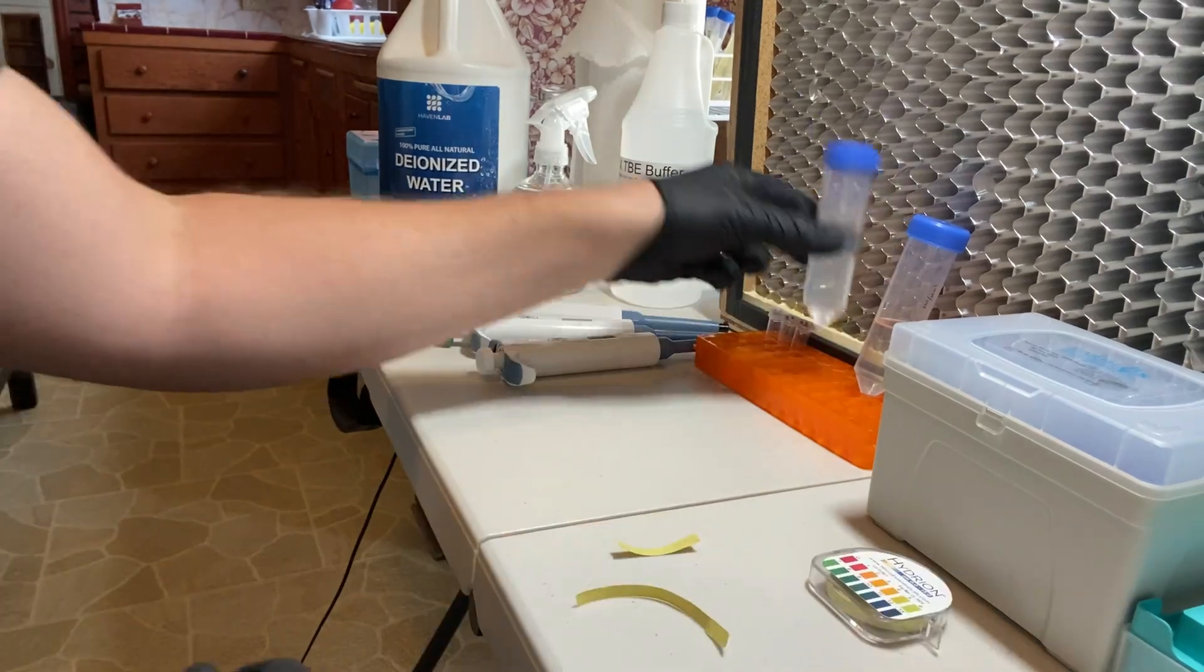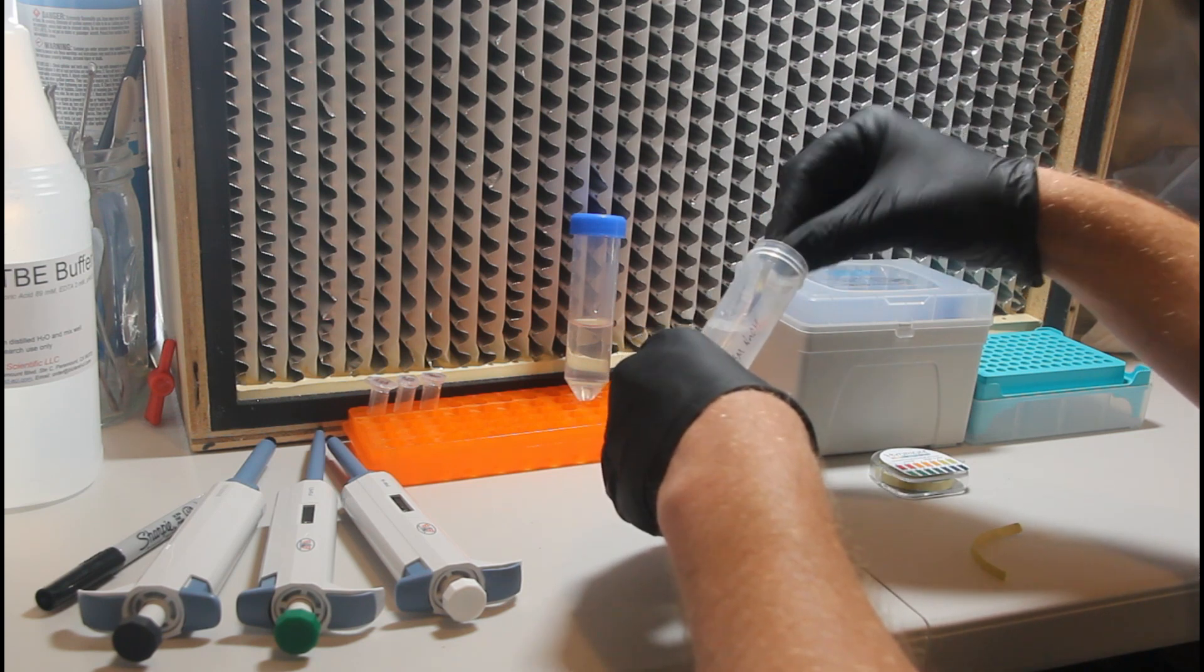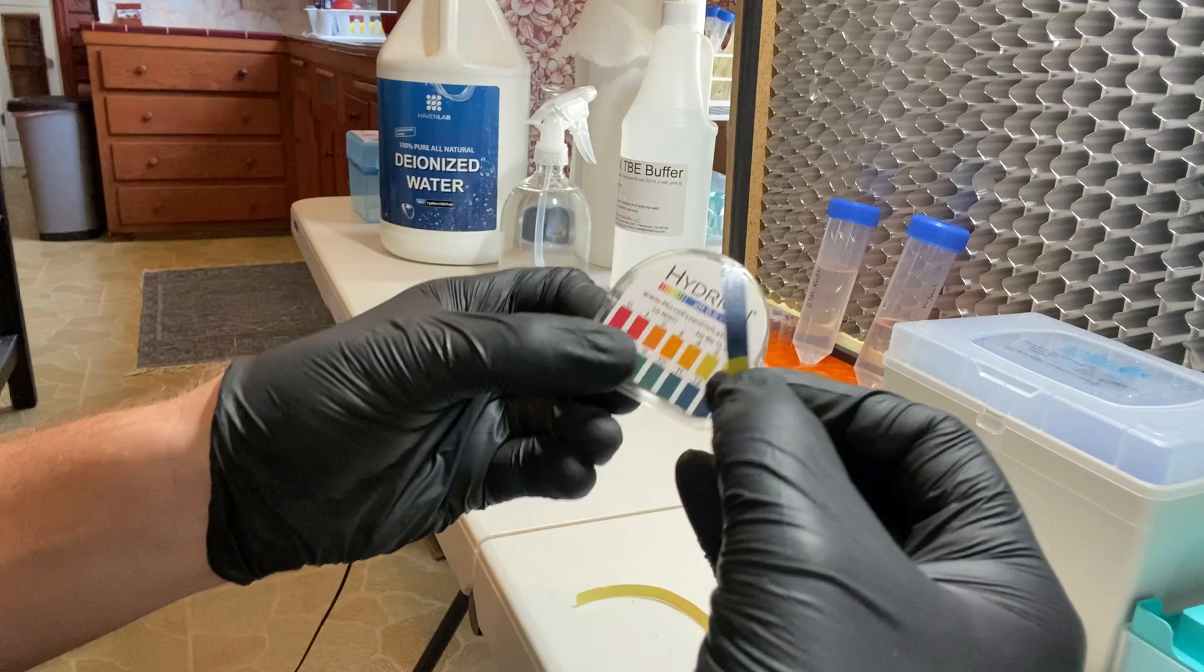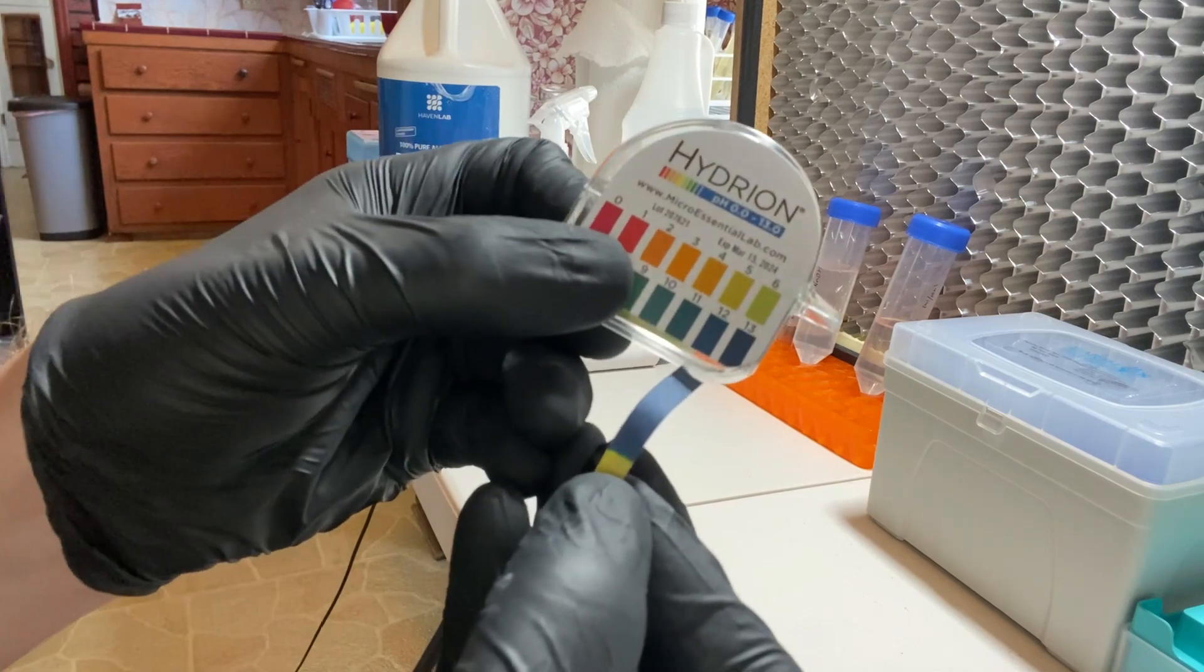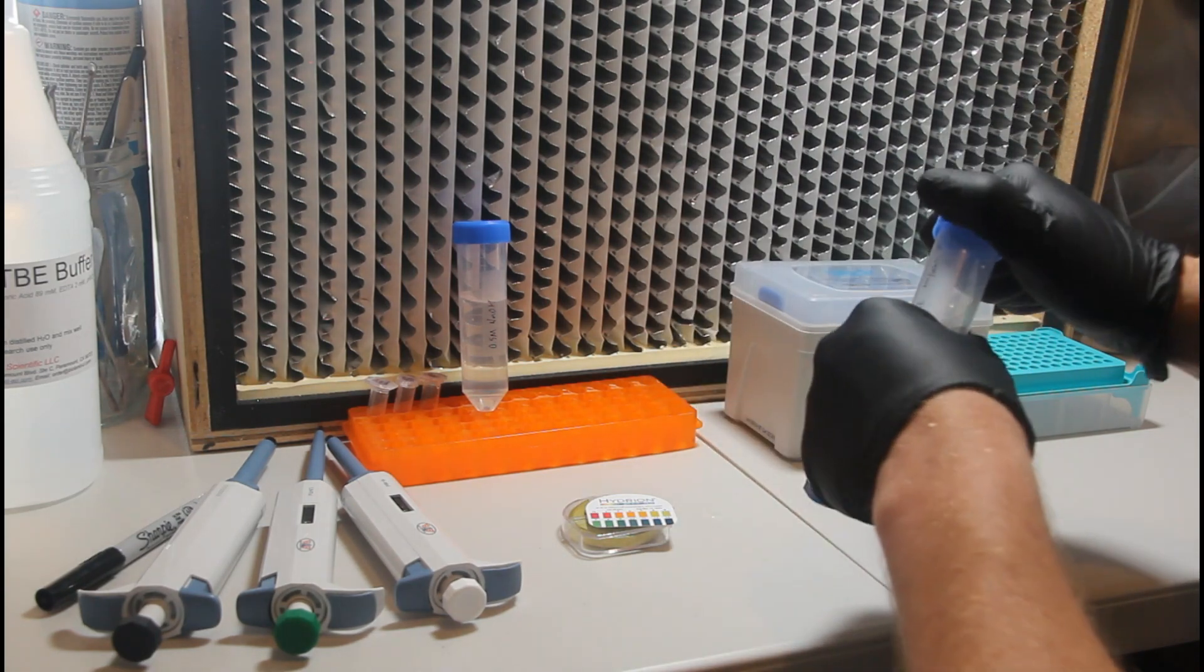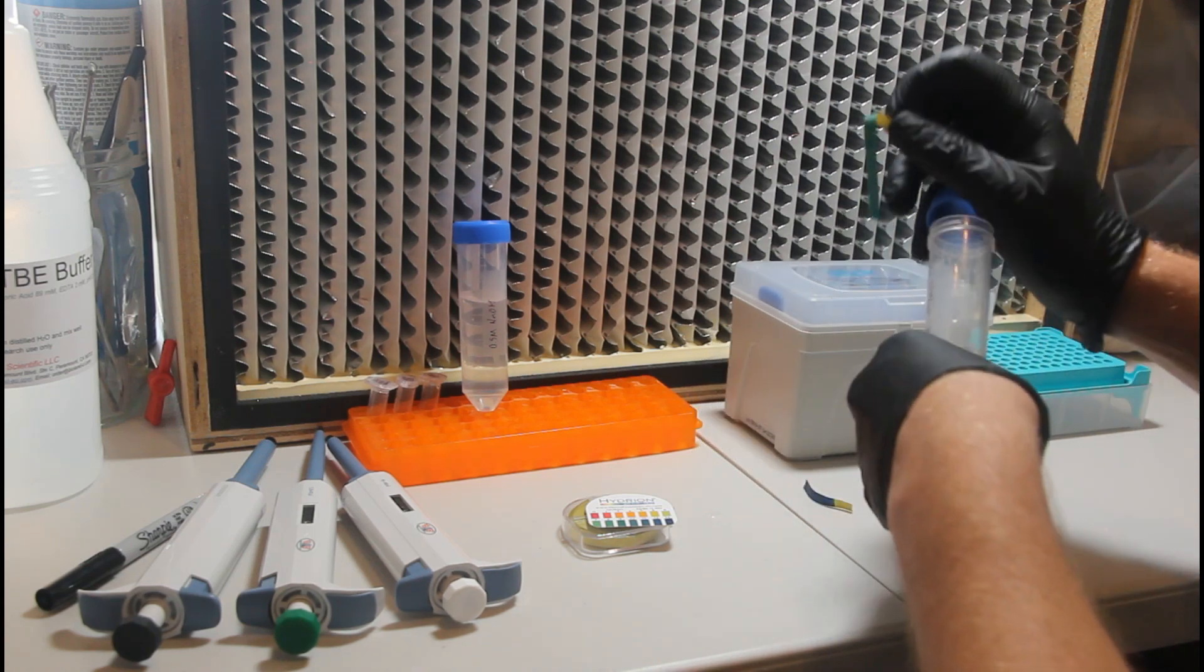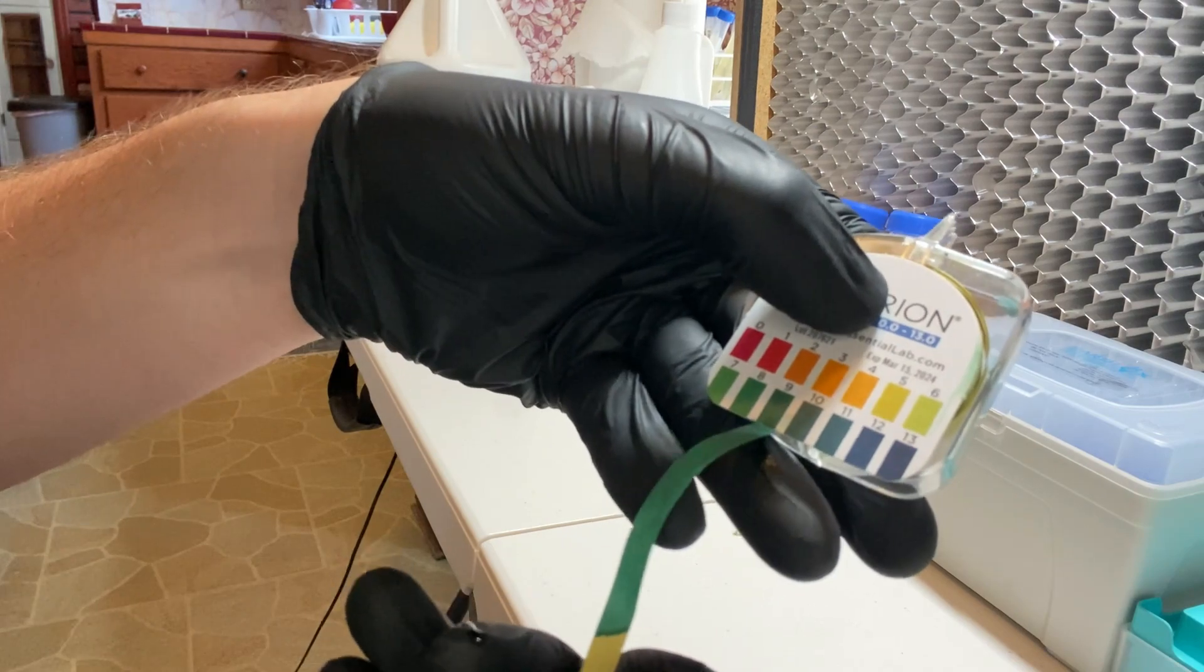Here I have some pH tape, just so we can do a quick check of the pH of both solutions. For the sodium hydroxide, we should expect that it is a strong base. And so here I'm just dipping some of that tape in there and we'll use this little chart to confirm that it is about a pH 12 to 13. We'll do the same with the 1x TBE working solution. And this should be at pH 8. And it looks right on the money.